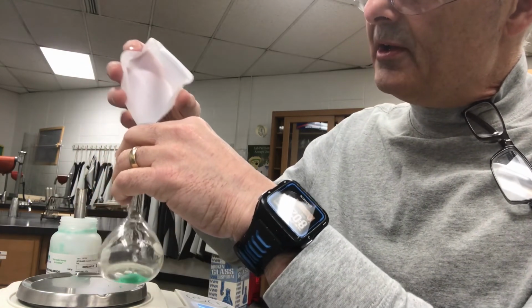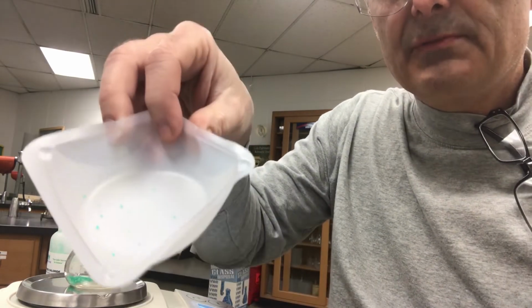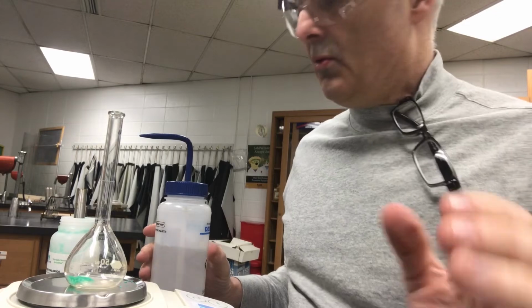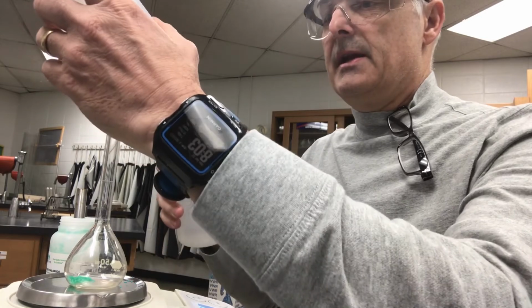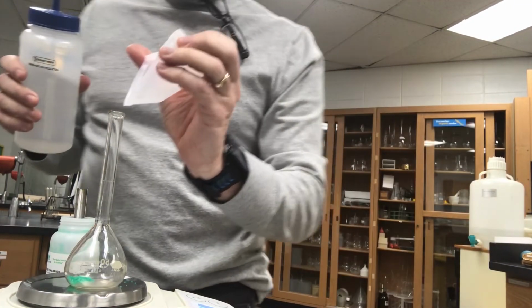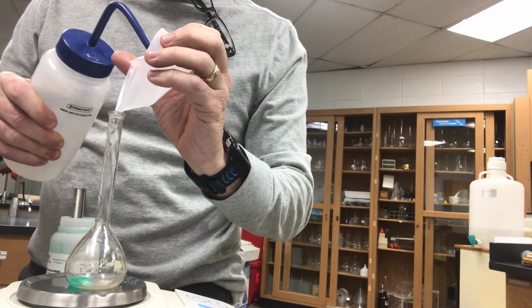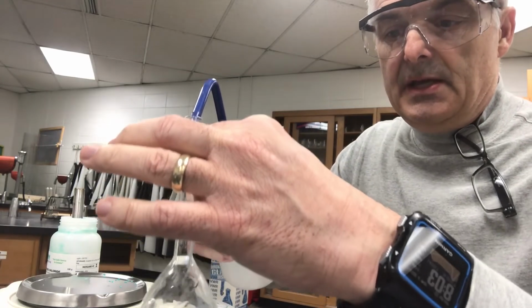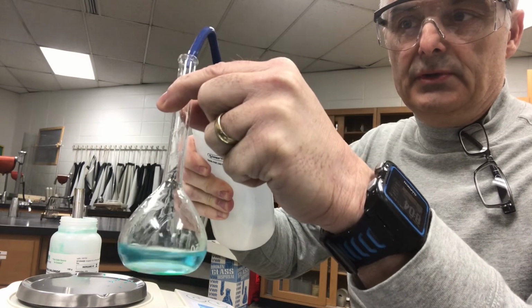Now it's important that all of the substance gets into the flask, and if you look, there's some little green specks right here. So to get all of it into the container, I need to take the container right here, and sort of scooch it this way, and I've got my squirt bottle, and I'm going to squirt, and then what's happening is I'm cleaning out the weigh boat, and so then the water goes into the special flask. Now I'm just going to add water, so I'm adding water. It creates kind of a cool blue color right here.